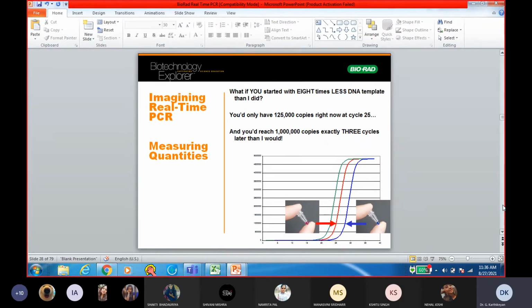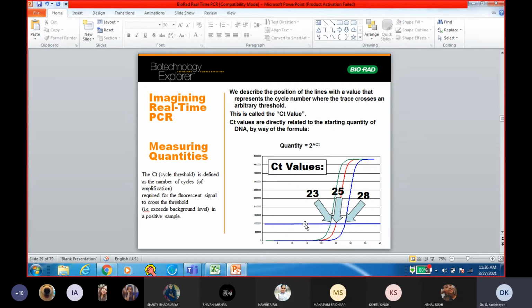But we are not going to go into discussion, except that we will say that this detection generally uses a thing called CT value. Okay, so I'm sure all of you must have heard about CT value in the real-time PCR when we do our corona test, right? So CT value is nothing but cycle threshold.